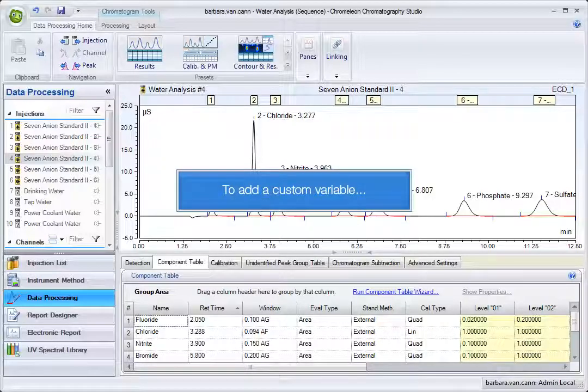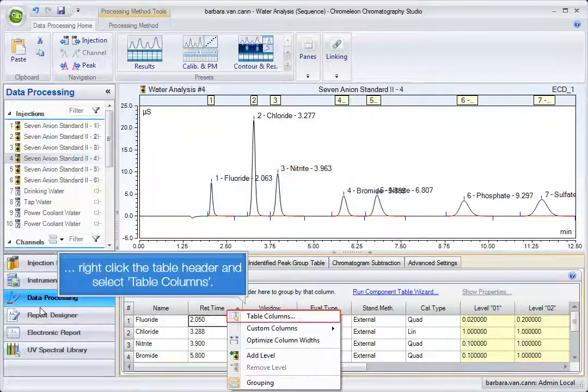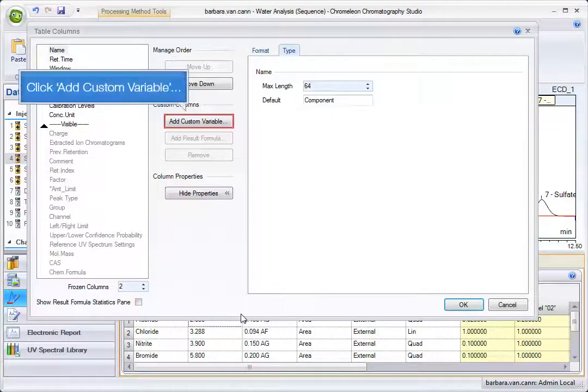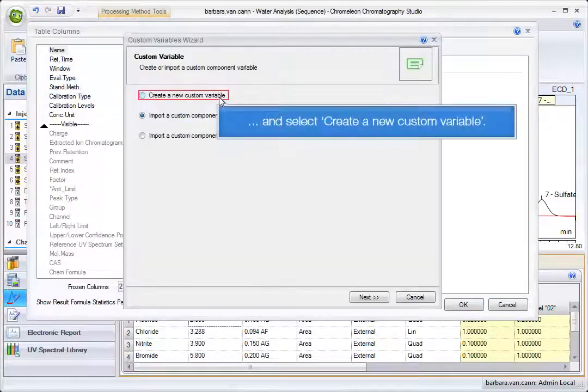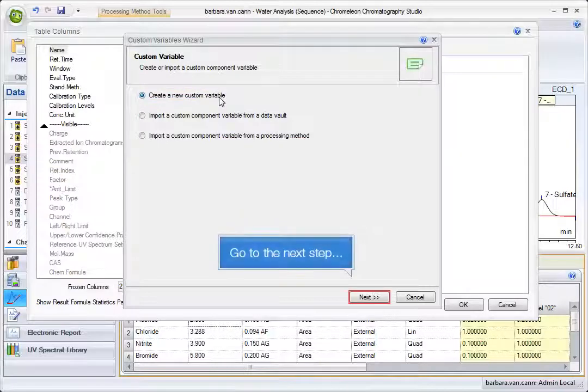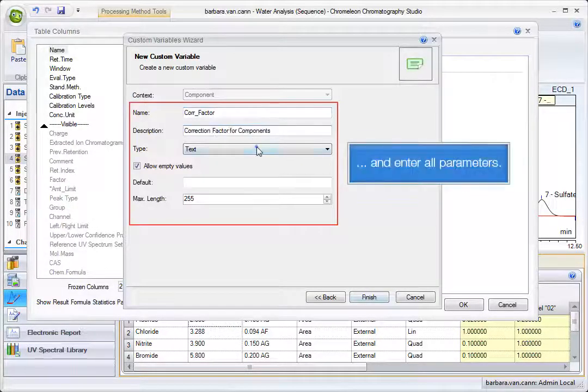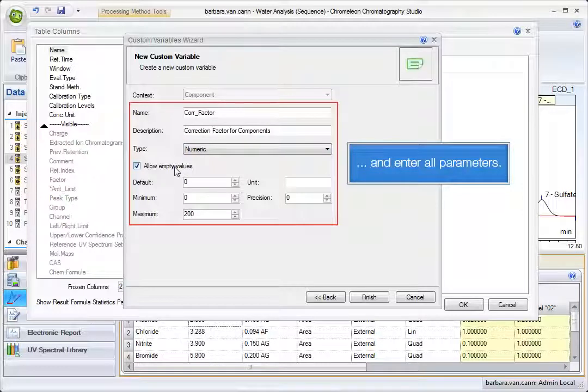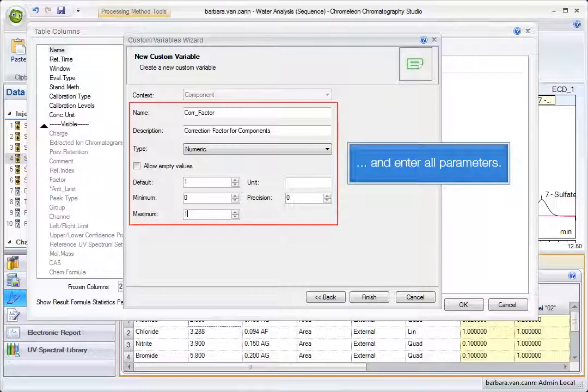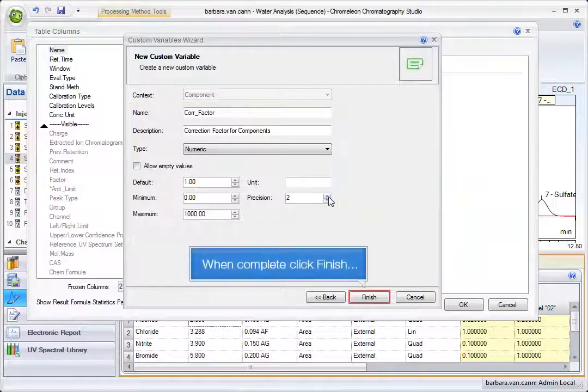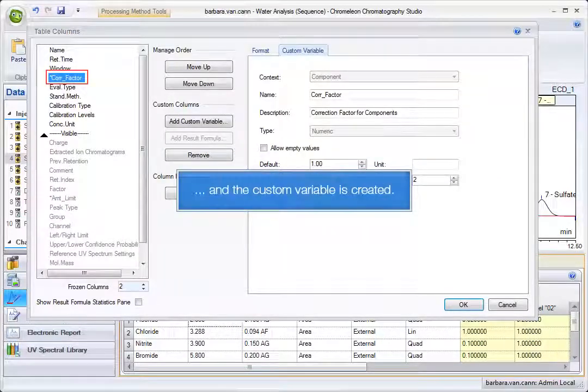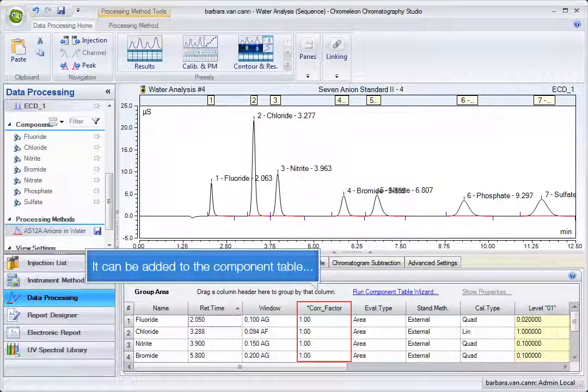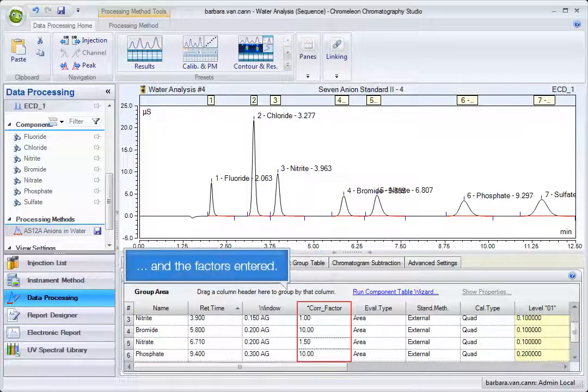To add a custom variable, right-click the table header and select table columns. Click Add Custom Variable and select Create a New Custom Variable. Go to the next step and enter all parameters. When complete, click Finish and the custom variable is created. It can be added to the component table and the factors entered.